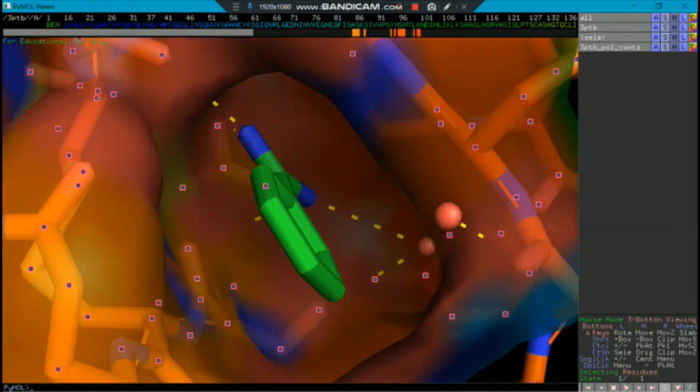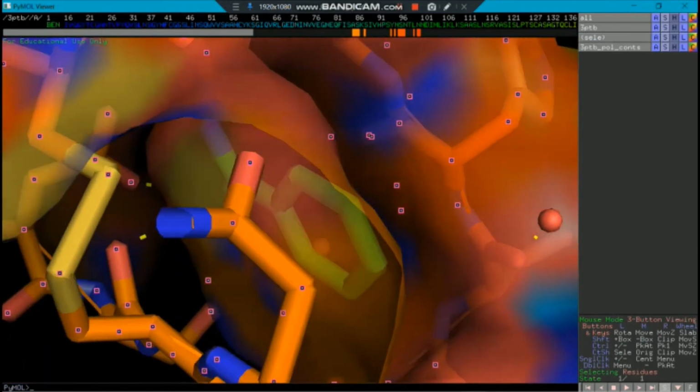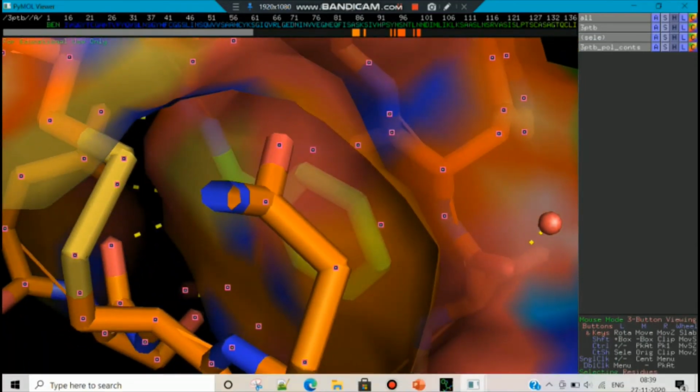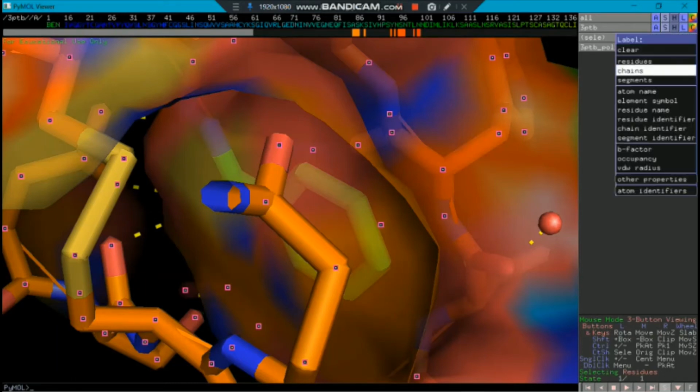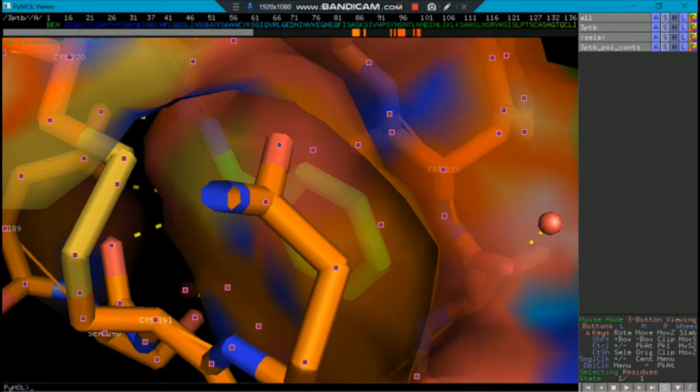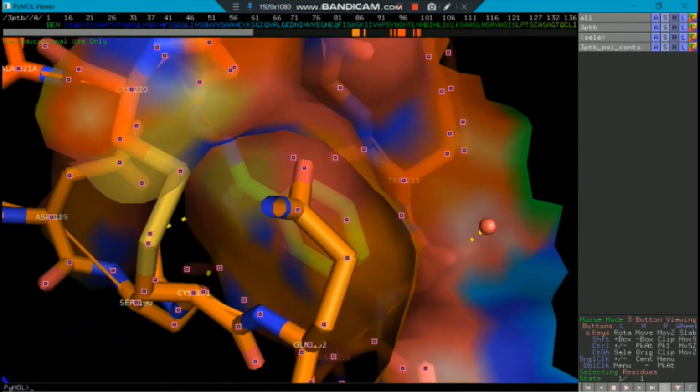See, these are interacting with the ligand, right? So how is this water molecule actually interacting, and what is the importance of water molecules in this interaction? So we have to see. Actually, what happens in the X-ray diffraction data is that the water molecules are placed so as to properly crystallize our protein molecule. So what we could now do is possibly name the residues.